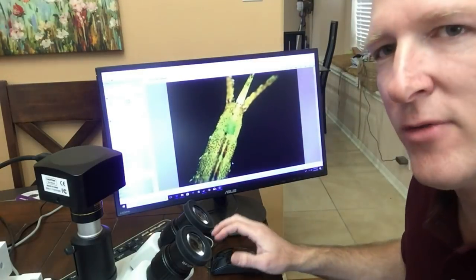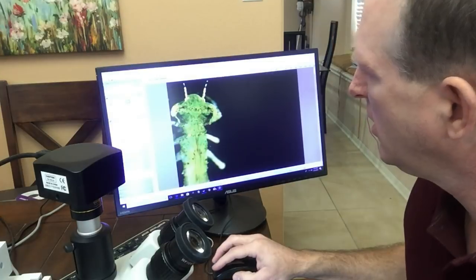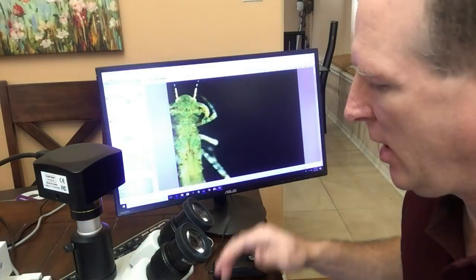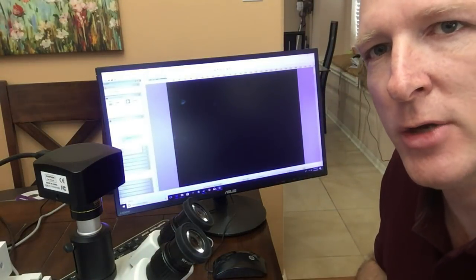Very interesting, all the different parts of the mayfly nymph. Now what I did is I put essentially a black mouse pad on the bottom, and that way we have a real good contrast between the nymph and the background.